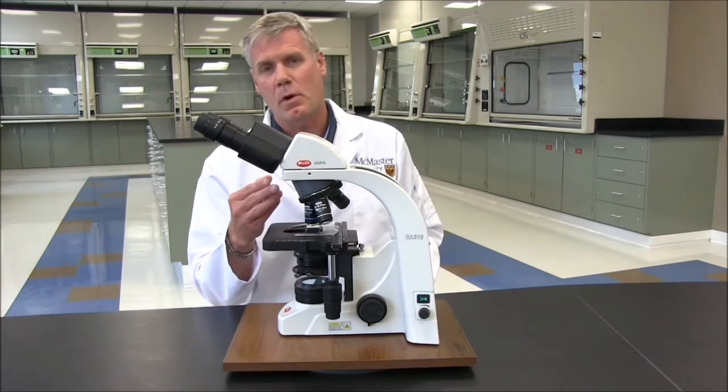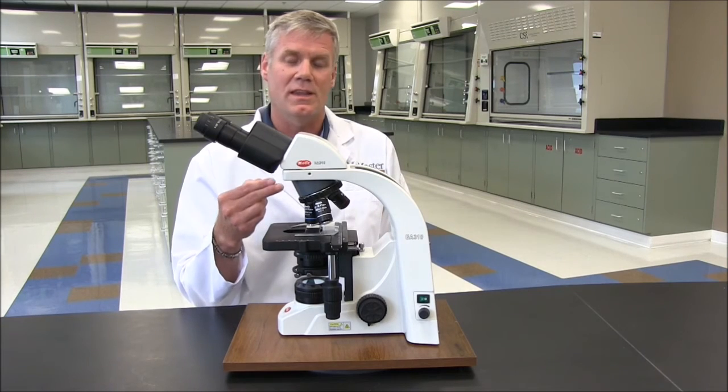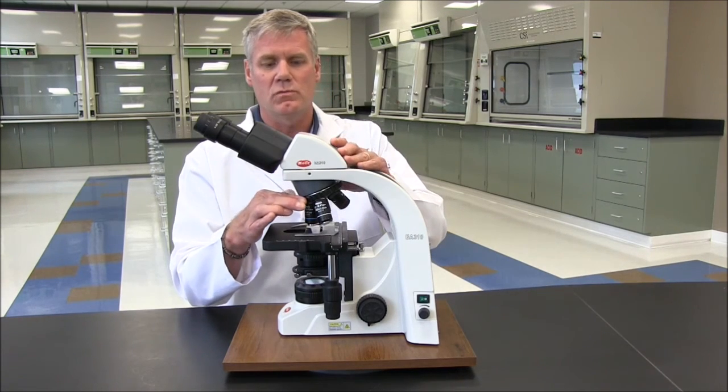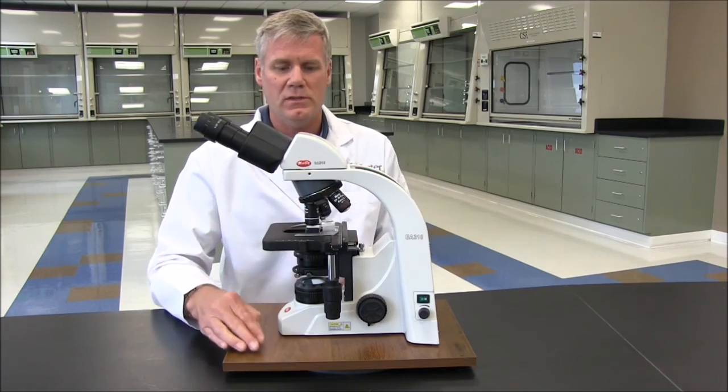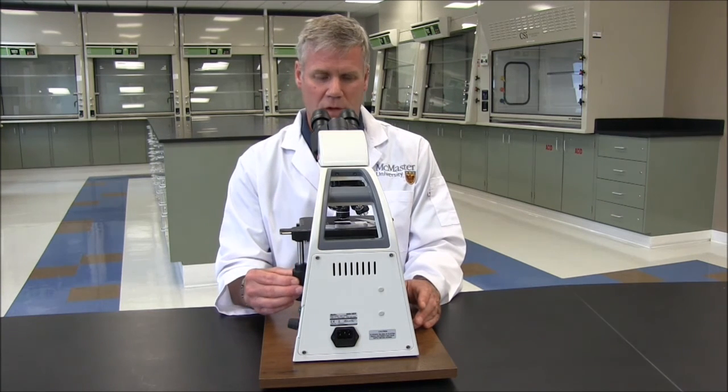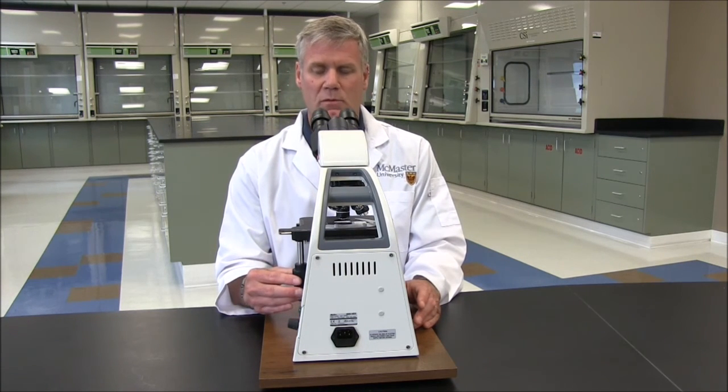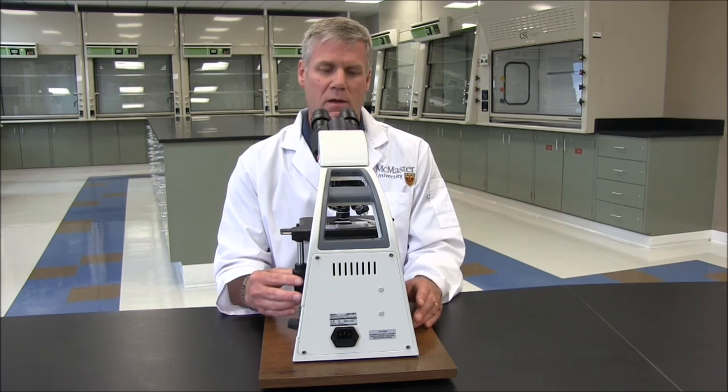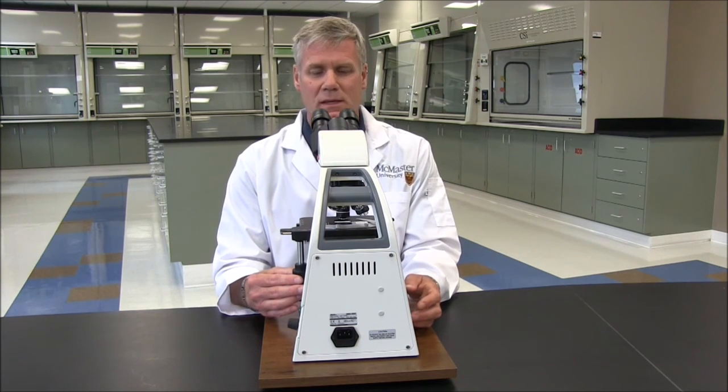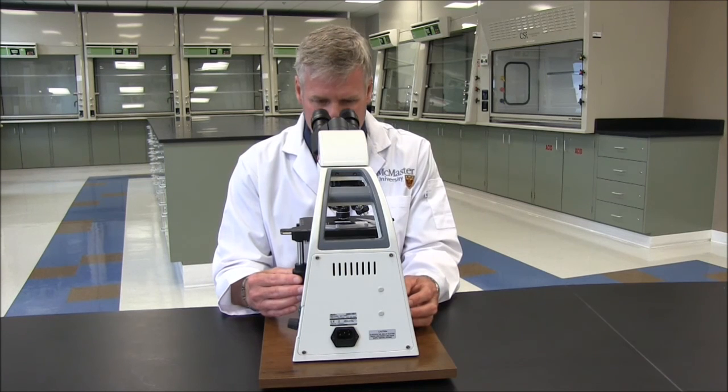Because these objectives are par-focal, if we want to change to the next higher power, we don't have to lower the stage. Just rotate the next objective into place, do a bit of fine focusing, and carry on. With my right hand, I'm going to use the travel knobs to move the specimen around left and right, forward and back. With my left hand, I'm going to keep it on the fine focus to get the clearest picture of my specimen.